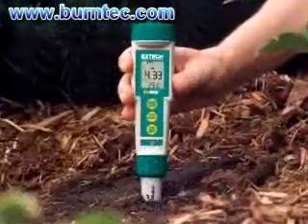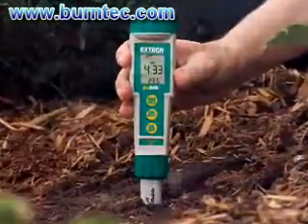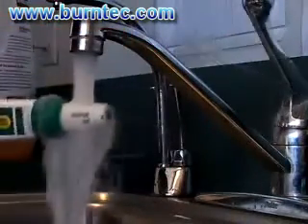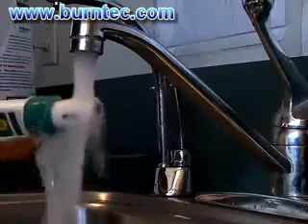What sets this meter apart is the unlimited flexibility and easy maintenance. To clean, simply rinse the tip with tap water and dry off with a soft cloth or paper towel.